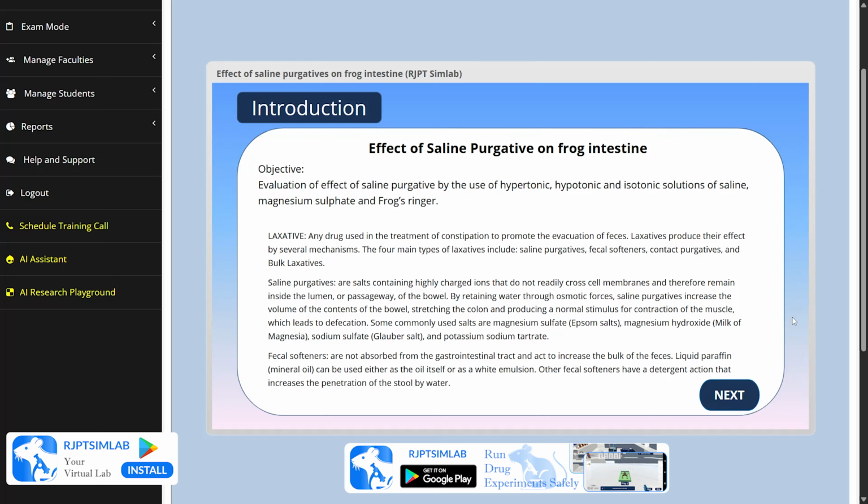In this video, we will study the effect of saline purgatives on frog's intestine. At the end of this video, we will be able to tell about the purgative effect by the use of hypertonic, hypotonic and isotonic solution on frog's intestine. So now let's start with the video.